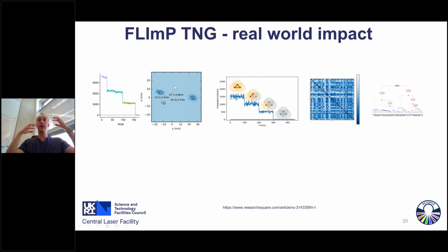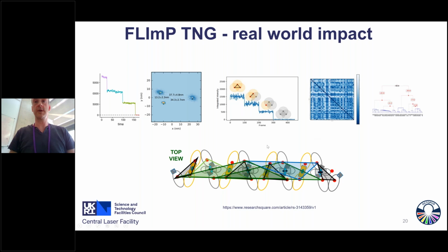So obviously there are going to be far fewer of those in the data sets, but it's an independent subset of the data, so independent measurements that actually give us 2-dimensional information, so not just separations but also angles. We could then, again using the Wasserstein metric, compare and contrast the triangles, and essentially using a Bayesian clustering algorithm, group the triangles into how many distinct sets of triangles there were. We could then compare those triangles, so the separate 2-dimensional information, with our model that came from the 1-dimensional FLImP, and identify that they were consistent with what we predicted from the other data. So essentially it was a validation with 2-dimensional information of our model.